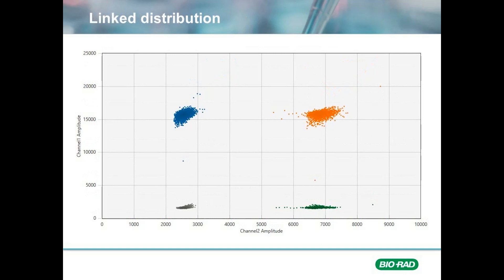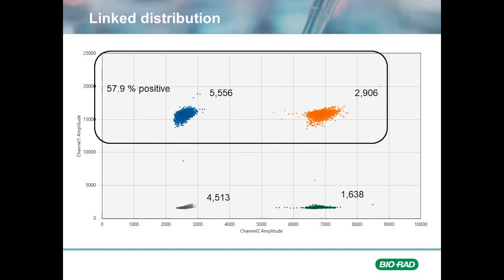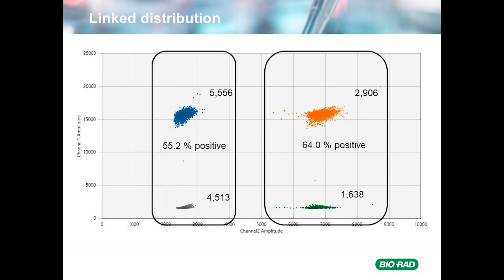Now let's look at a sample that has linked molecules. When items are linked, the molecules that would migrate to either a FAM or a HEX droplet on their own are stuck together and end up in the double positive cluster. Looking at the total percentage of droplets that are FAM positive, we see that they are 57.9% for the entire assay. When we look at the ratio of positives as a function of the presence or absence of the other target, we immediately notice that the ratios differ. The ratio of FAM-only positive droplets is reduced, and the ratio of FAM positive droplets that are also HEX positive is increased.